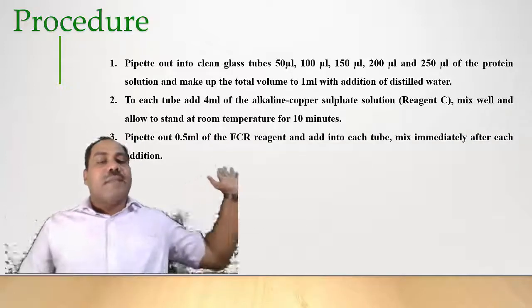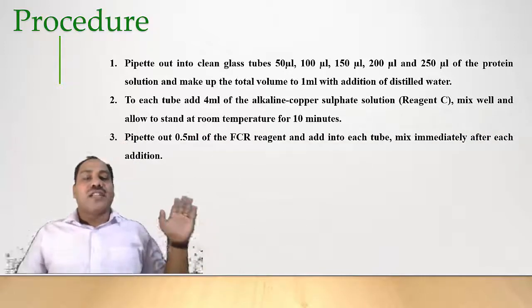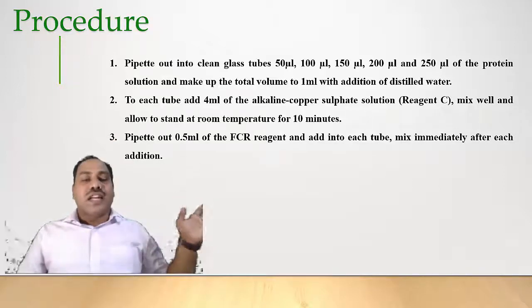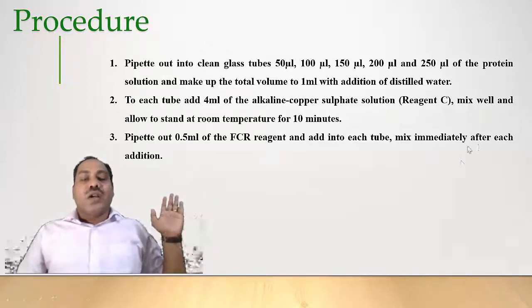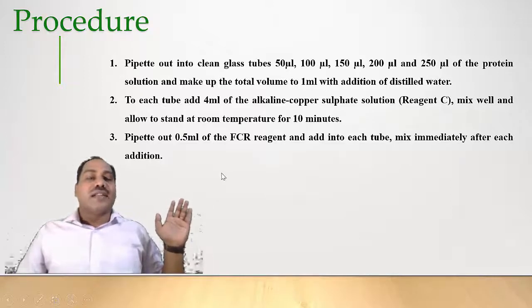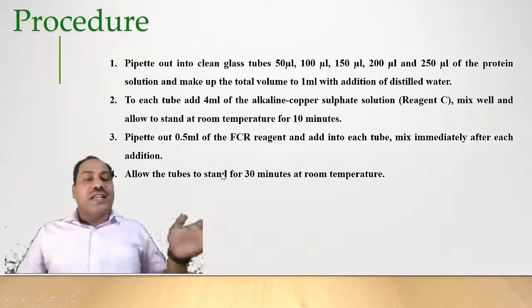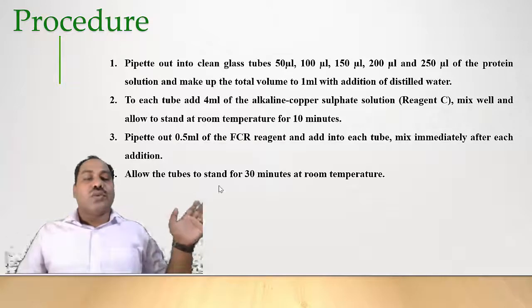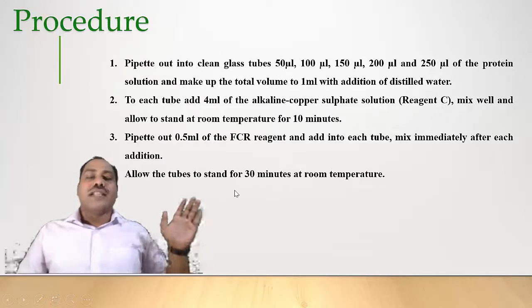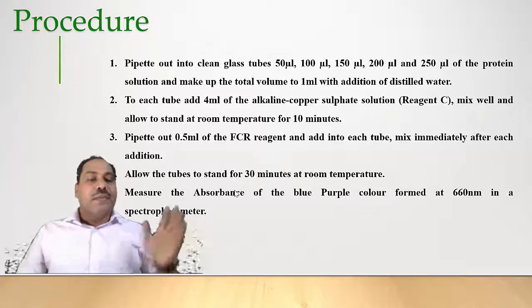Next, pipette out 0.5 ml of Folin-Ciocalteau reagent and add it into each tube, mixing immediately after each addition. Then allow the tubes to stand for 30 minutes at room temperature. Measure the absorbance of the blue color formed at 660 nanometers using a spectrophotometer, and prepare a blank tube similarly.